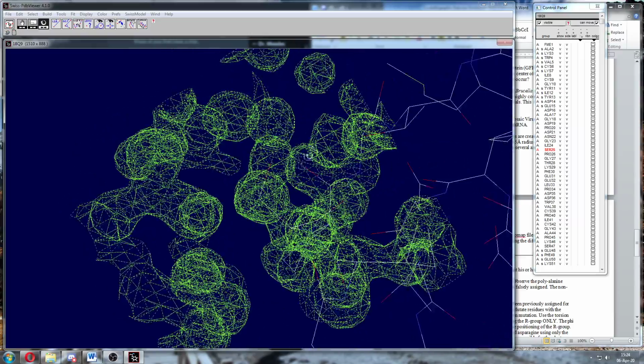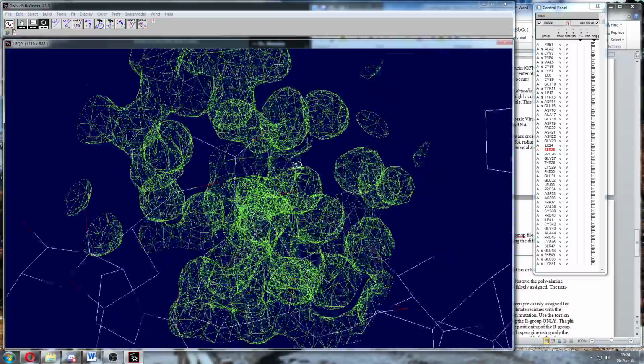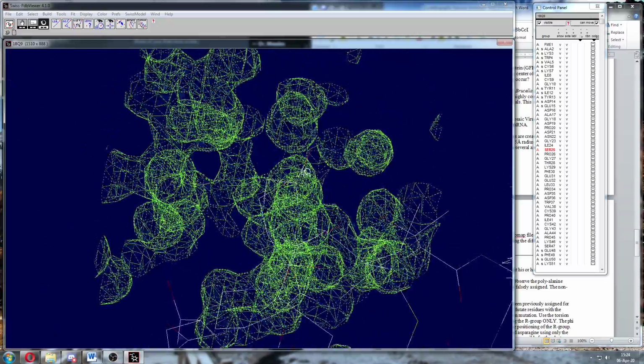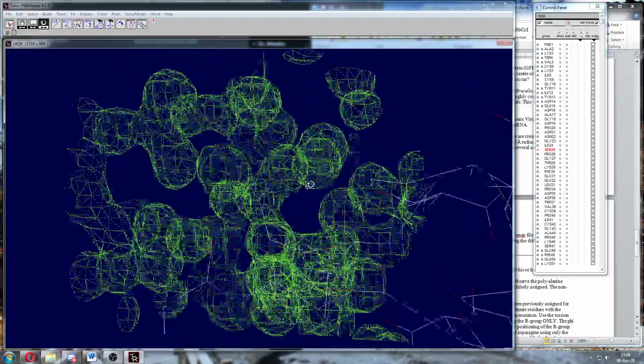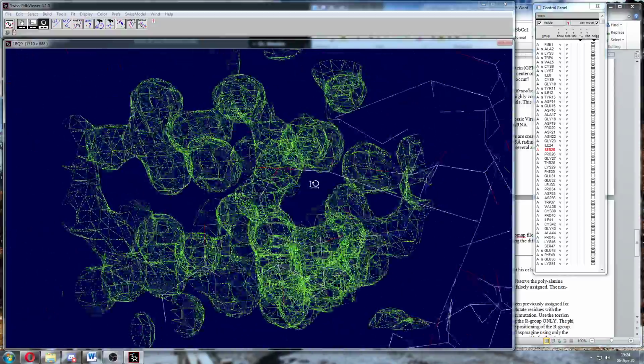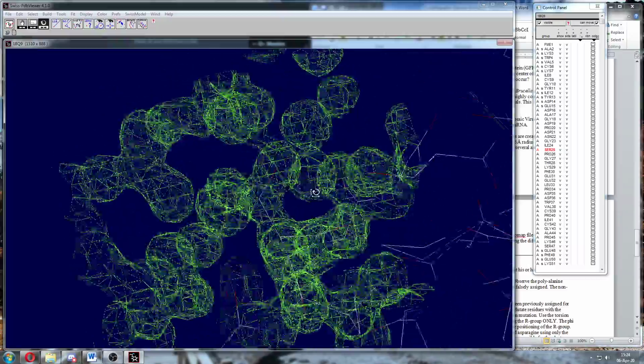So what would appear as a single atom and be within hydrogen bonding distance of this serine's oxygen? It's kind of a tricky question. Those are actually water molecules. And you're thinking, hey, a water molecule is not a single atom.